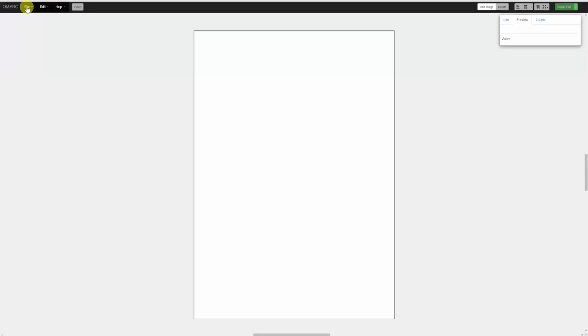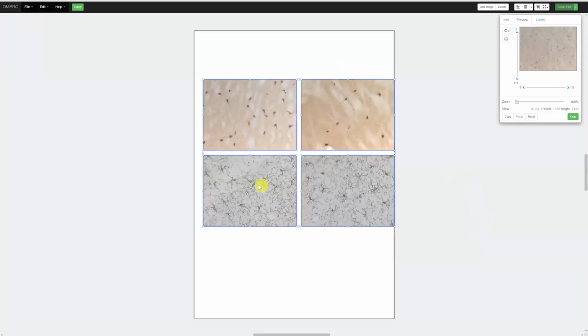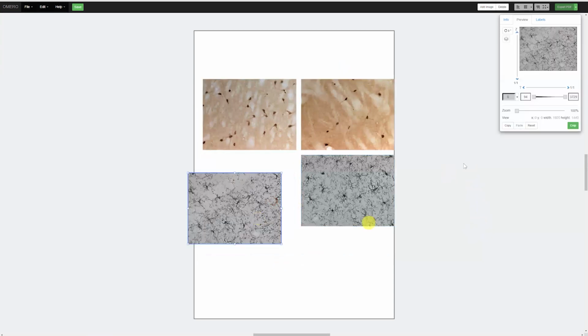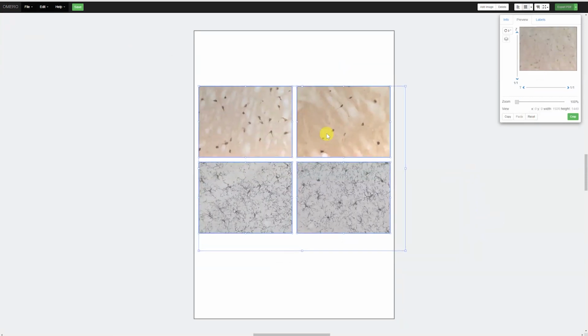And now there's one other thing that's kind of fun, is this is called Omero figure. And every image in Omero has an ID number. So I'm going to put in a number of images that I've already selected and have it create a figure for me. So if I go up here and I move that around, I go, gosh, I really need to rearrange that. Let me just put it back so everything's nicely lined up.